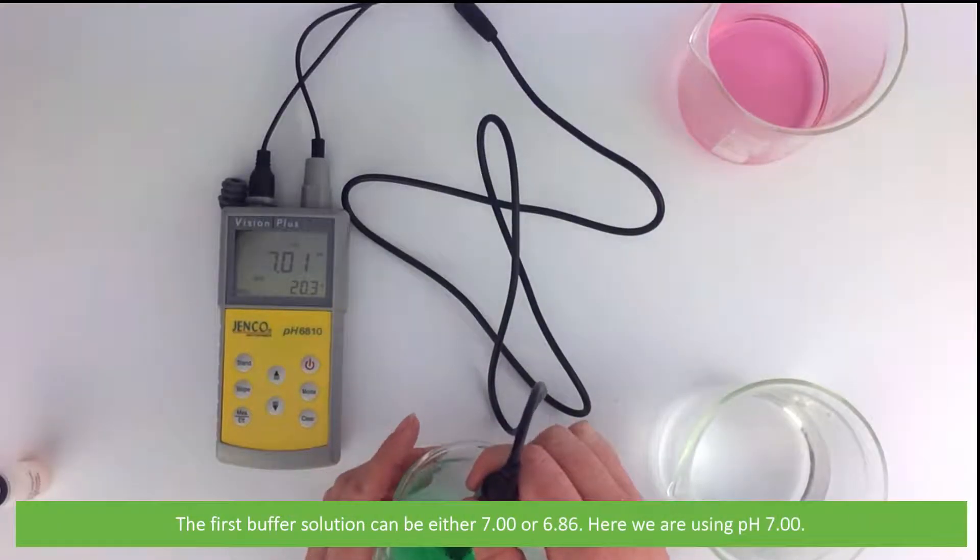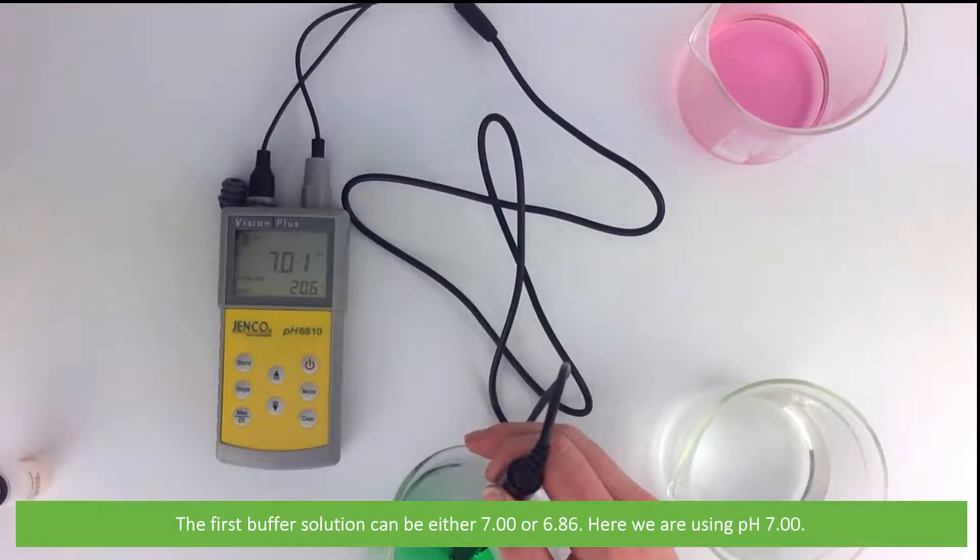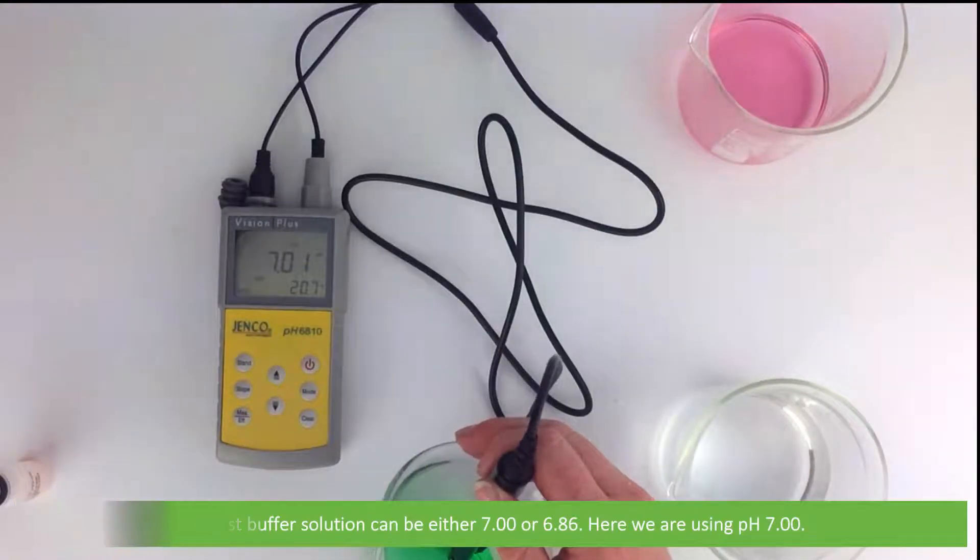The first buffer solution can either be 7.00 or 6.86. Here we will be using 7.00.